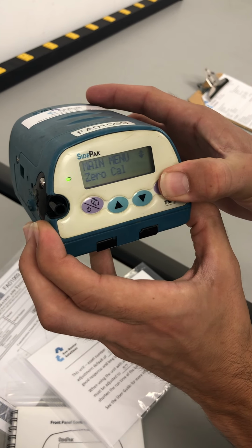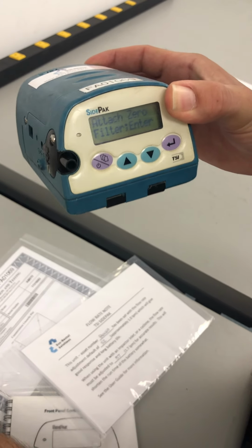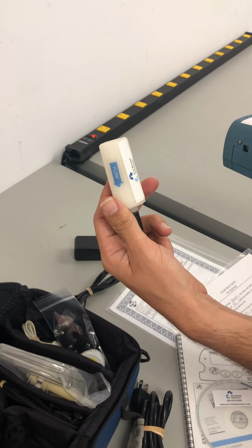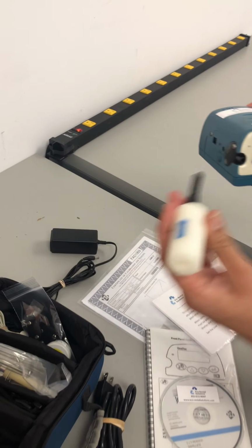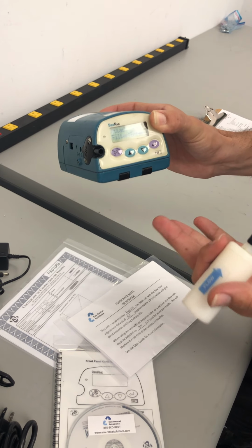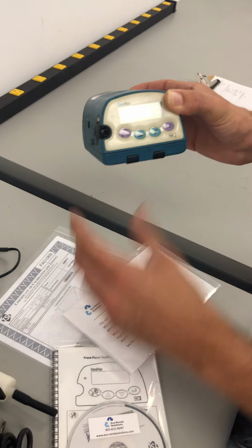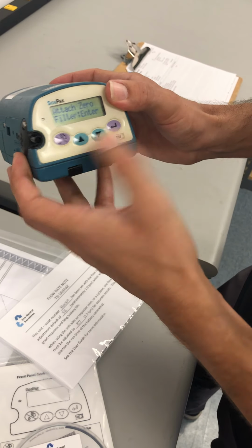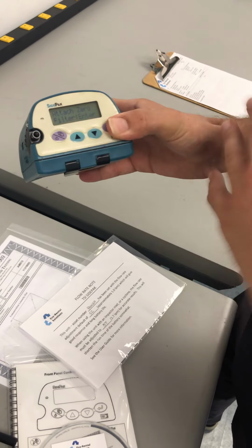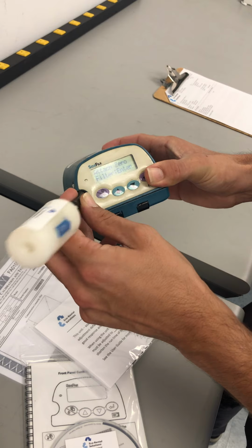Okay. We'll enter into it, and the zero filter is going to be in your case here. Hard to miss one of these guys. Got it. We've got it all set up for you, so all you have to do is put it on, press enter, and it'll go through a 60-second zero calibration. That'll be pretty straightforward. And to get out of here, once you go through that process, we can go ahead and just do it real quick if you like. Sure. It won't hurt anything.